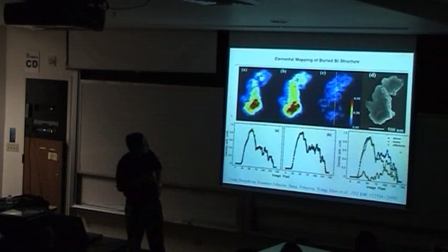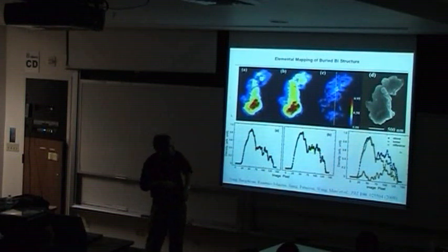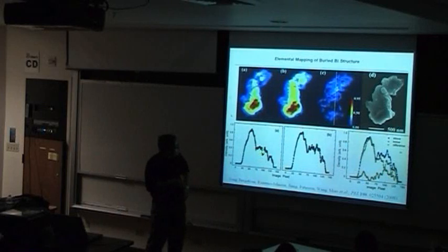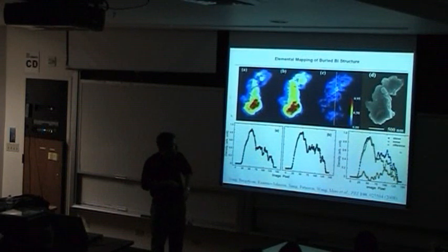And now we did an independent reconstruction. These two curves correspond to independent reconstructions along this center line, and this is very consistent. And then we align them together. We have to normalize and do subtraction, and this shows a subtraction distribution of the bismuth. And this is much larger than the reconstruction error. Reconstruction error is very small, about 1 to 2%.